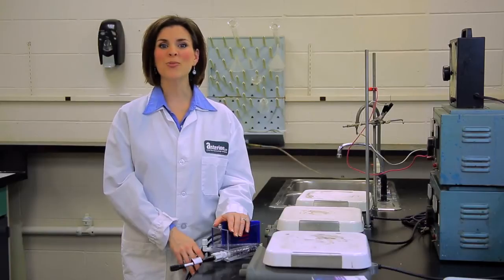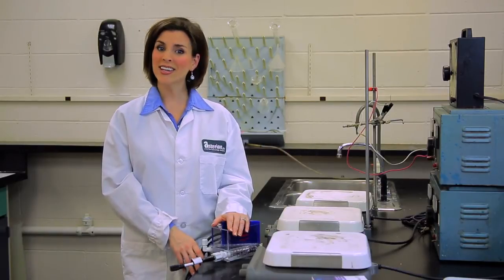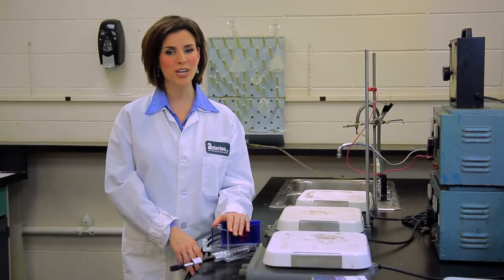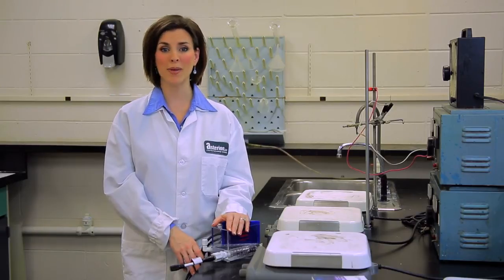In the first video, we discussed how to run a hull cell. In this second series of videos, we'll review the interpretation of the results of a variety of plating baths.